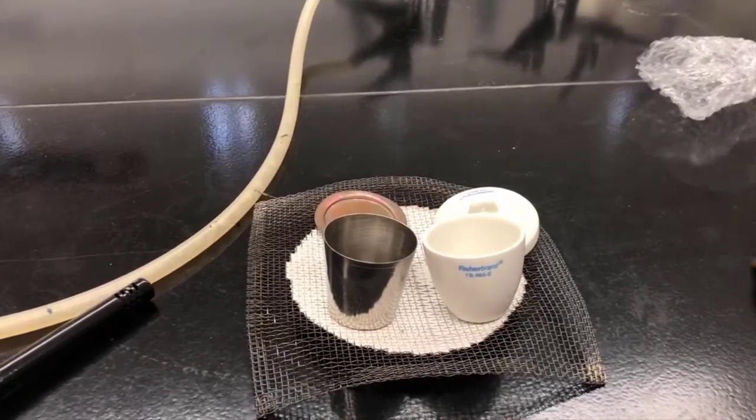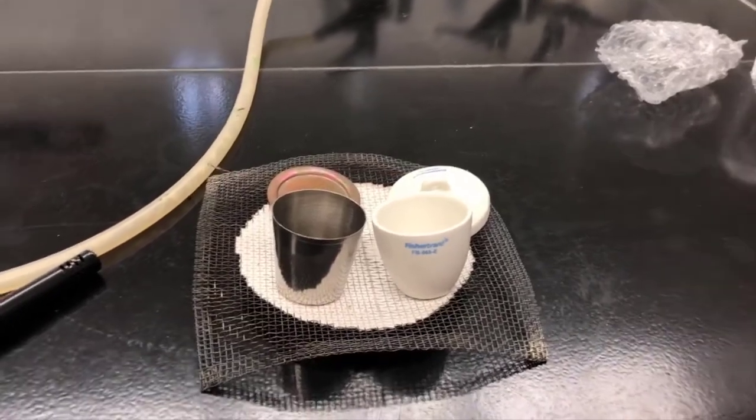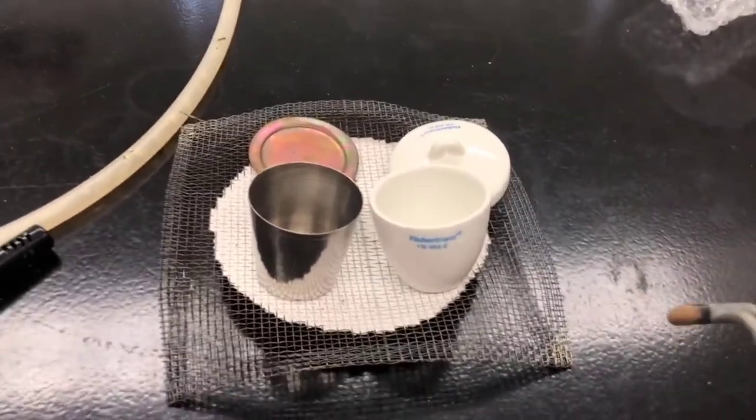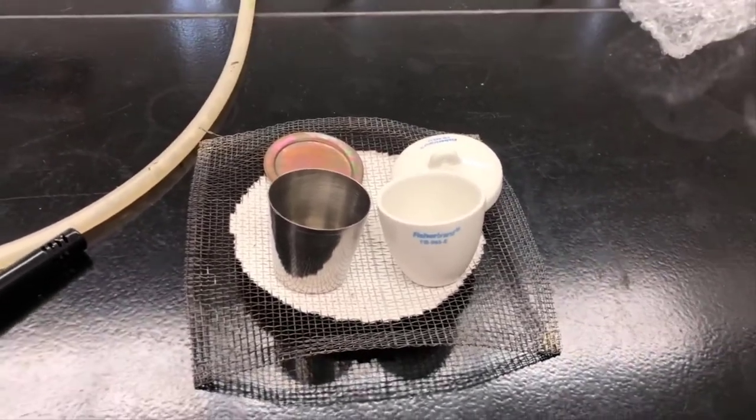There's a couple of examples of crucibles. The one on the left is a steel or stainless steel crucible, and on the one on the right, this is porcelain. That's what we'll be using in class.